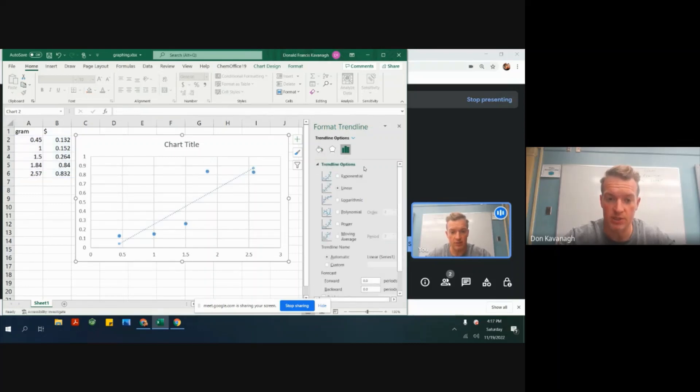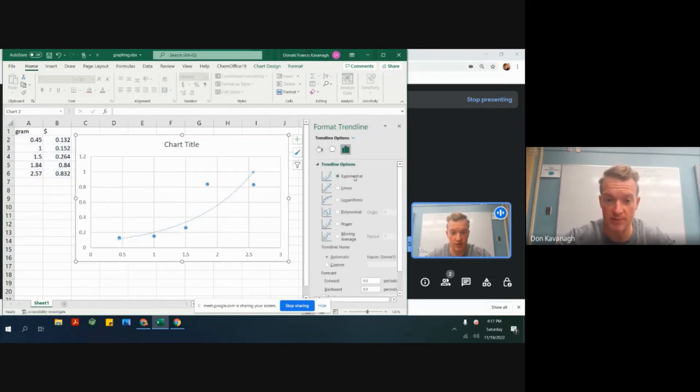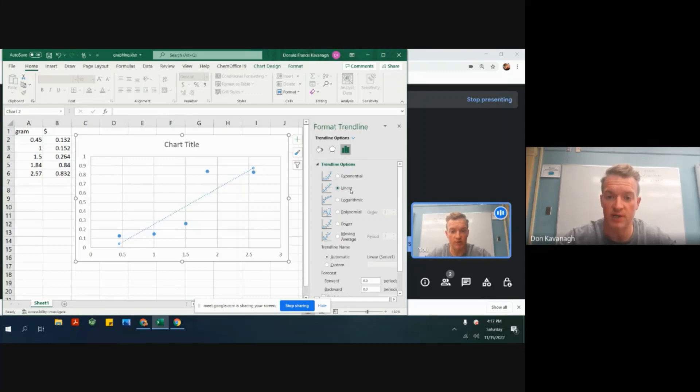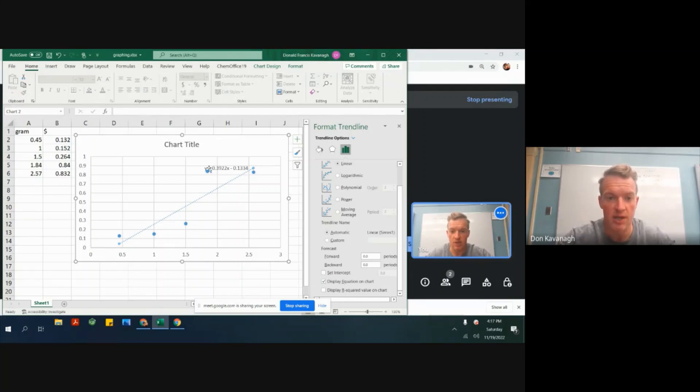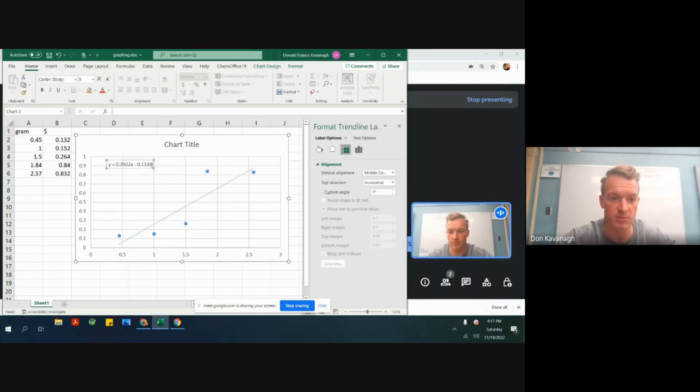And then here we see all these different types of trend lines right here. We want to find linear, which is the default. Then we scroll down here and it says display the equation on the chart. And here we have our bread and butter, what we're looking for, the y equals mx plus b format for a straight line.